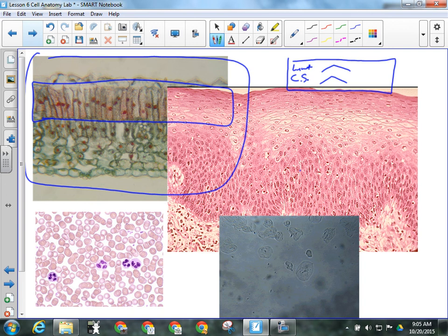You'll also see in some places there'll be pieces of scar tissue, or a capillary might be cut. Okay, in a place like that, and you see this kind of big dark red spot. Don't label anything around that. Okay, because it's just the cells are really compressed in that area, and they're really hard to label. So look for cells that are as big and stretched out as possible.